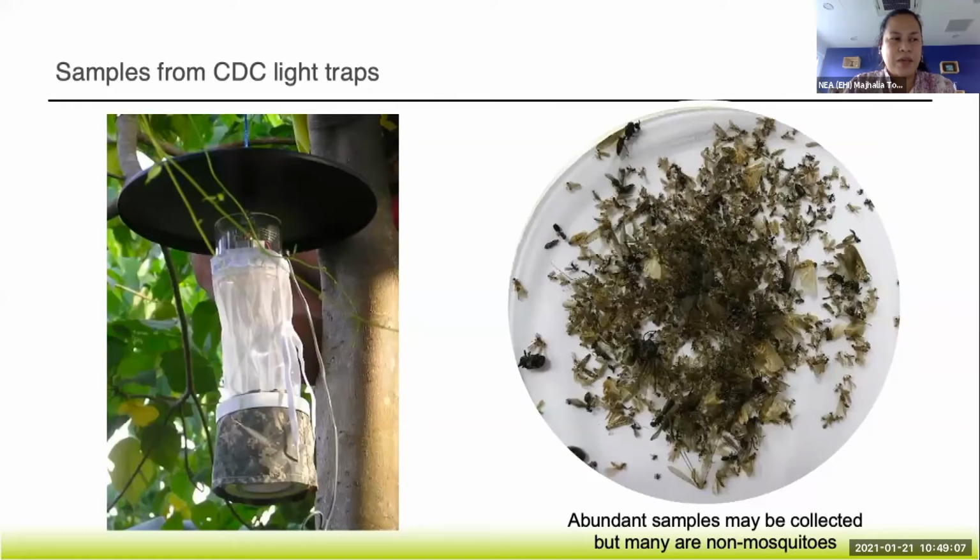Okay, so if you're pertaining to the post-spiracular area, for Aedes albopictus, the mesepimeral scale patches should be connected. So it should not be two separate spots. That will be for Aedes aegypti.